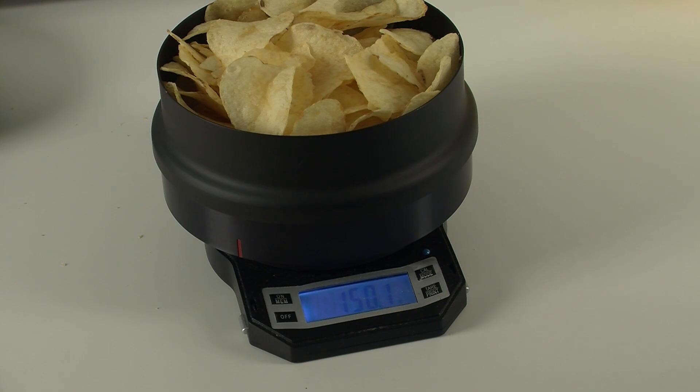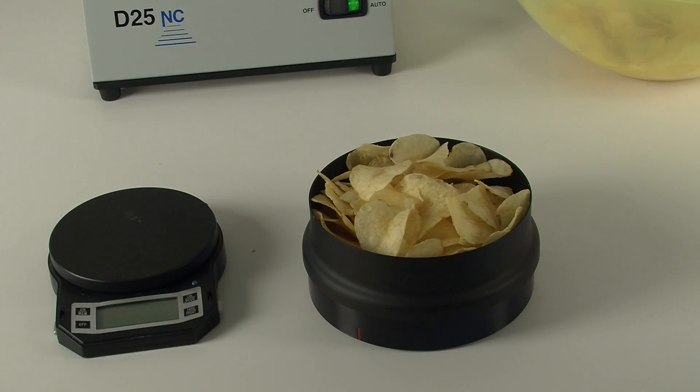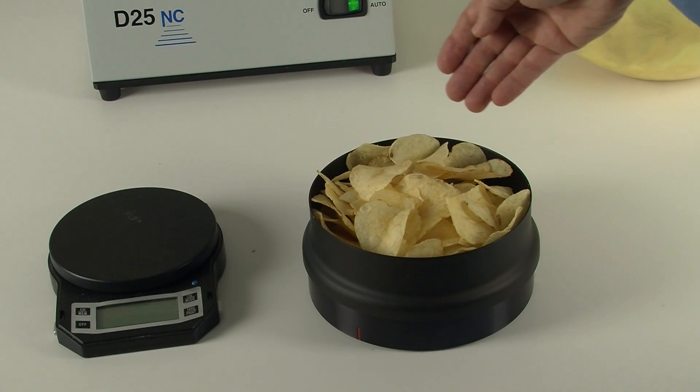If your standard operating procedure calls for a different amount, please follow those instructions. Ensure that the chips are uniformly distributed in the pan.